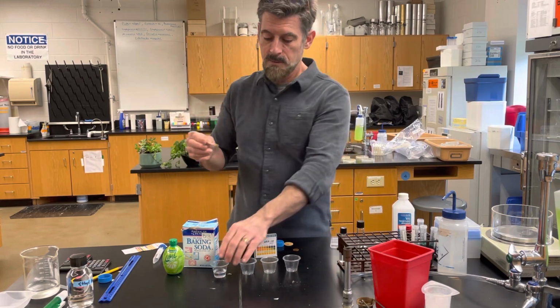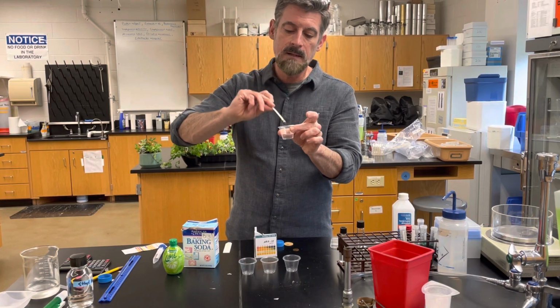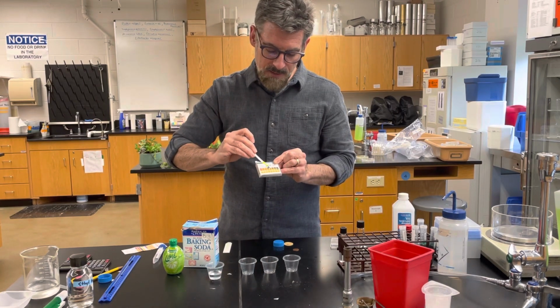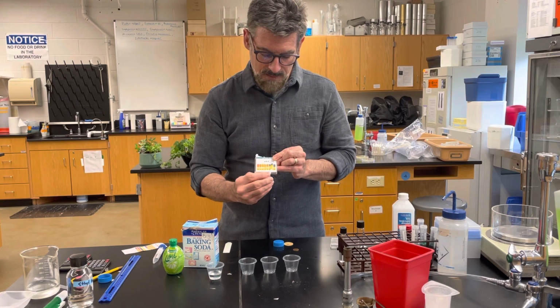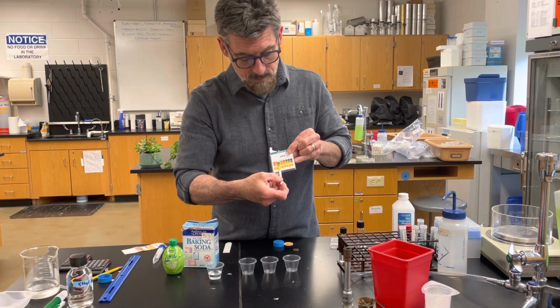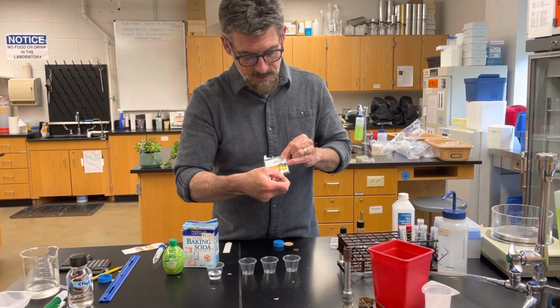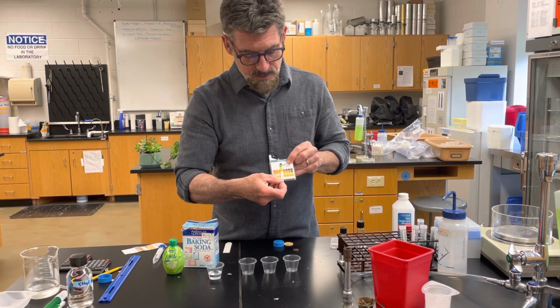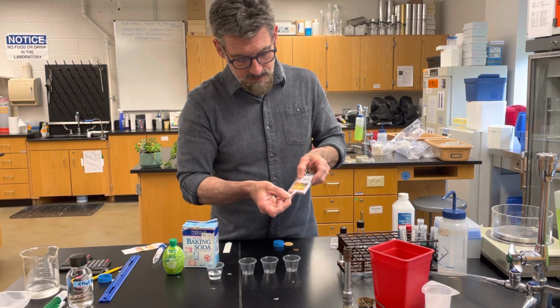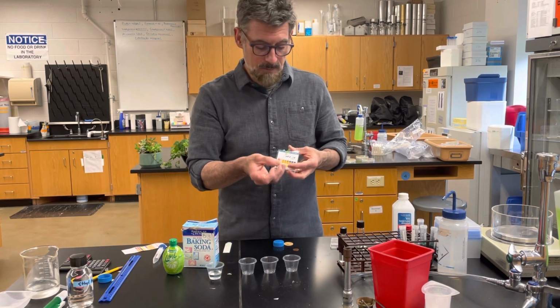So you're going to take a test strip like this and then get some, say, tap water. So I just got some tap water in here, soaking it in there, and now it's wet and it's going to change color. Now this is going to look a little bit different from yours. I'm going to try to match it up, and compare it to these colorful strips. You see, it's not pH 0 or 1 or 2 or 3 or 4 or 5. Now it's starting to get, no, not 6, because you can see the second block here looks more green, so it's much closer to 7 on this particular one. Go over here, nope, it's not 8 either, because it's much lighter than that. So it's a lot closer to 7, probably somewhere between 6 and 7. So you can say 6.5, and that would be the particular pH.